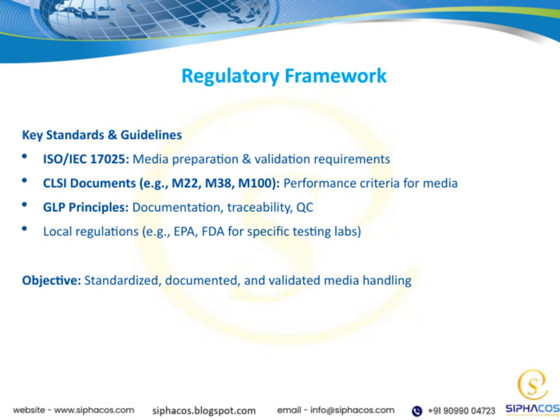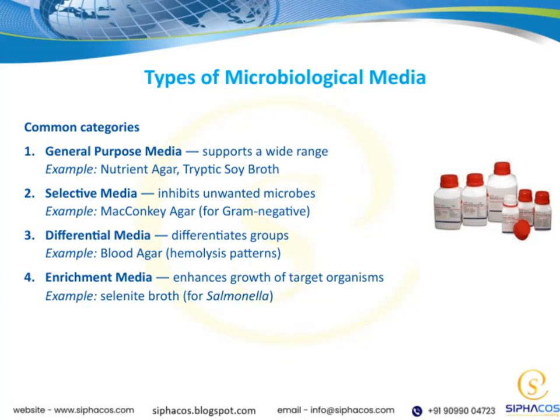The overarching objective here is to ensure that our media handling is standardized, well-documented, and thoroughly validated. This approach not only maintains high quality, but also supports the integrity and reliability of our testing processes across the board. Now, let's explore the different types of microbiological media that we commonly use in the lab.